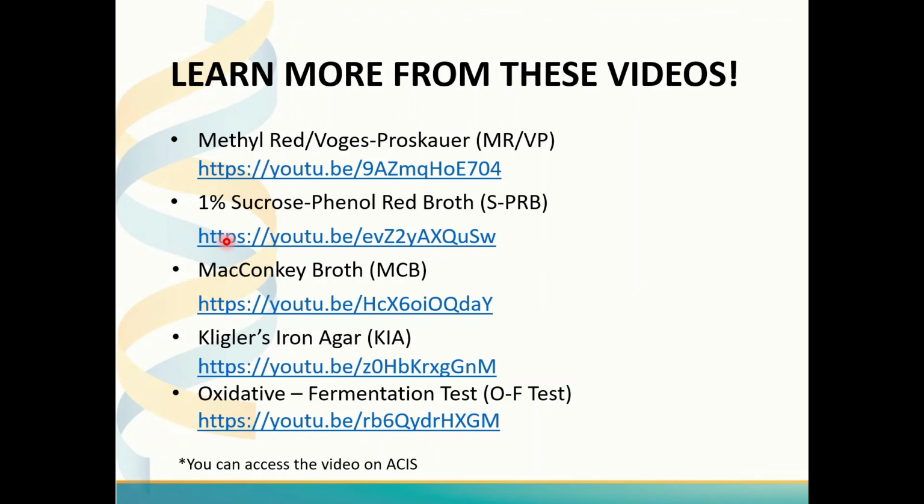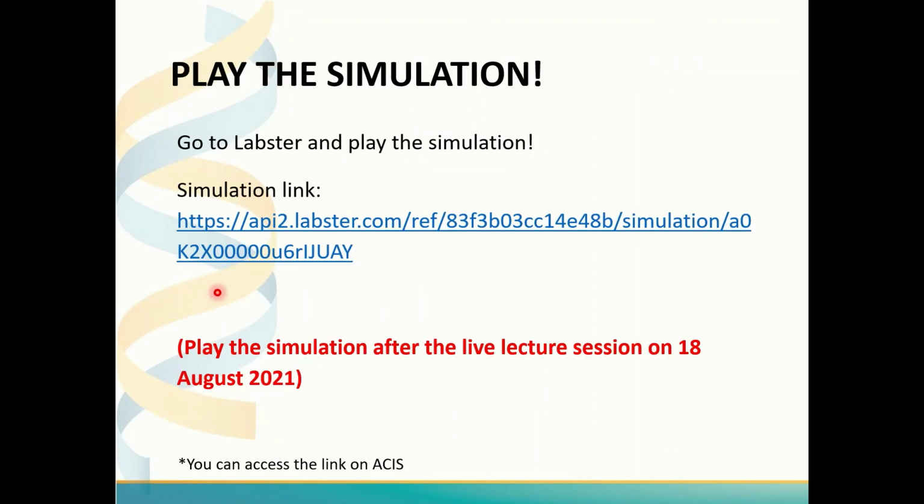So that's the overview of the carbohydrate utilization test for microbial characterization. Now, please watch these videos to learn the real practical lab session. And don't forget to play the simulation on Labster, but after the live lecture session.